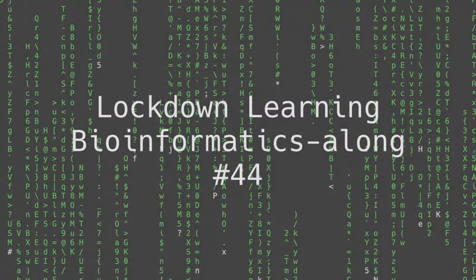And then what we spent the rest of number 43 talking about was this data transformation concept called the Burrows-Wheeler transform, which is used by a lot of these alignment protocols to transform the reference data so that it enables quite a few things. It enables it to be stored in a compact manner, and also renders it more searchable. And that was the key thing about this transformation, that it makes searching for matching sequences in your genome based on your reads a much easier process than it would be if you didn't transform that data in that way.